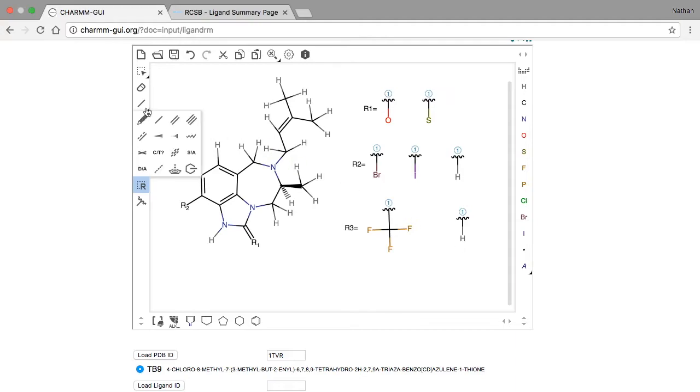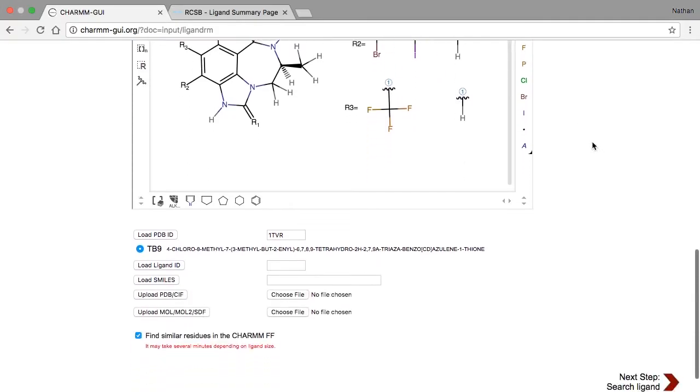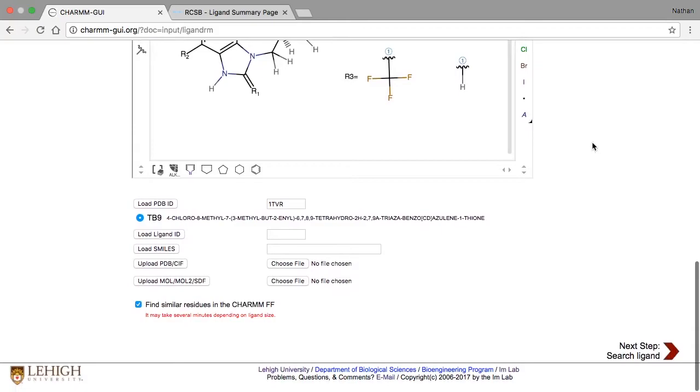Finally, because we want R1 to be double bonded, we must also use the double bond tool on the replacement for R1. We're now done describing the replacement groups, so deselect the option for finding similar residues, and then click next.